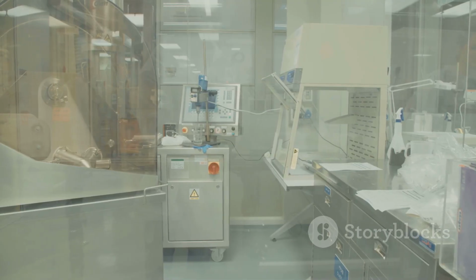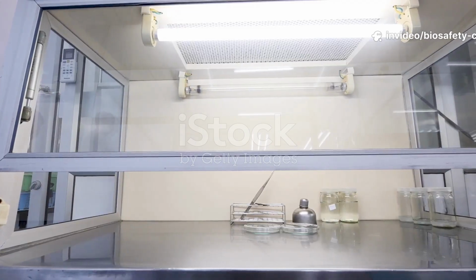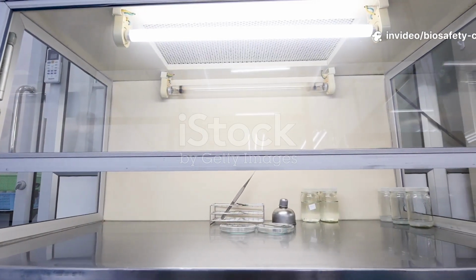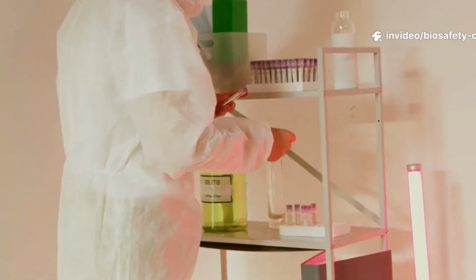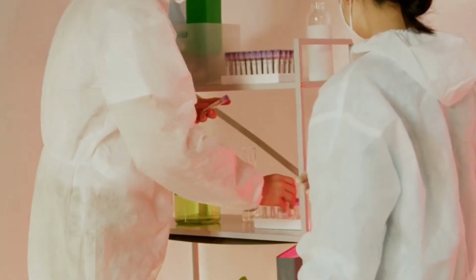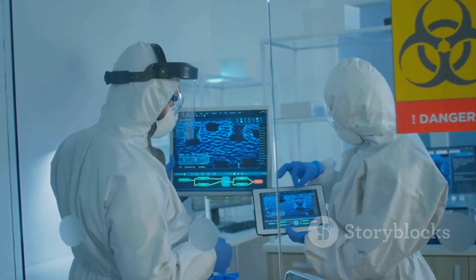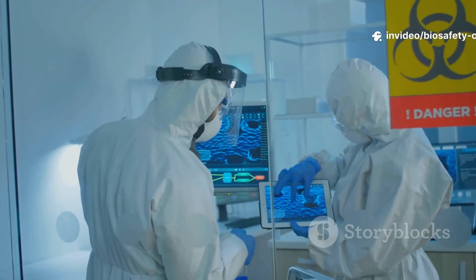We'll start with Class 1. Class 1 cabinets pull room air in at a minimum inflow velocity of 75 feet per minute, filter it through a single HEPA filter, and exhaust it safely. They protect you and the environment, but not your samples. These are great for low to moderate risk work. Think basic microbiology, where product protection isn't required.